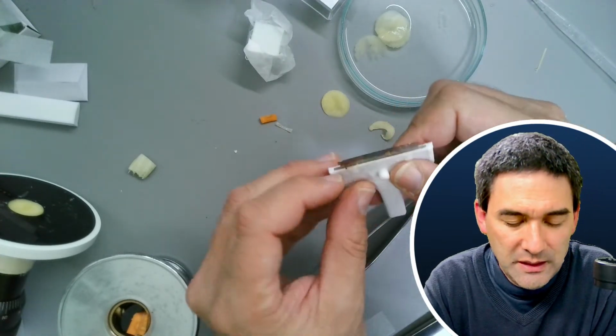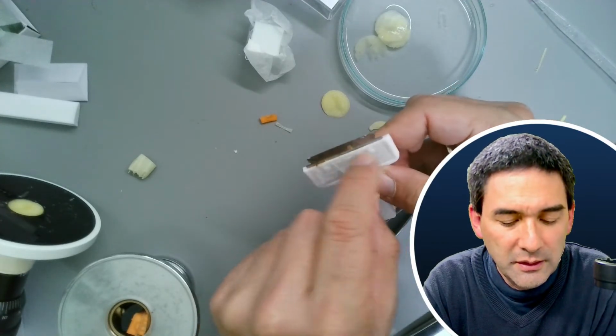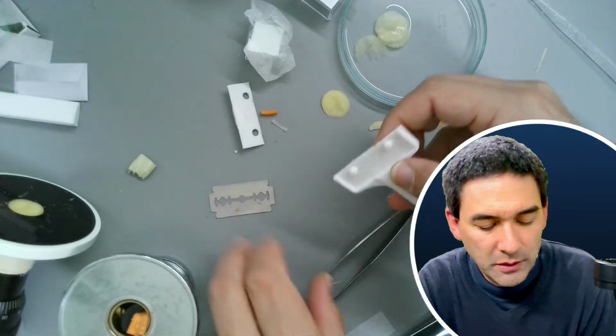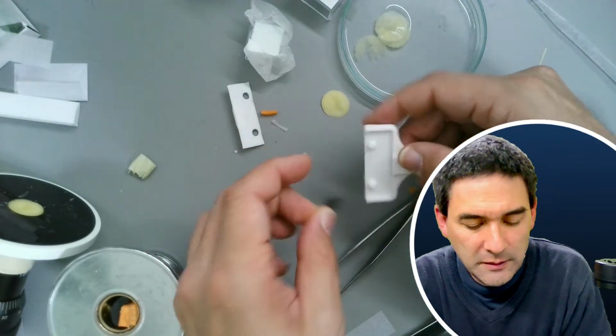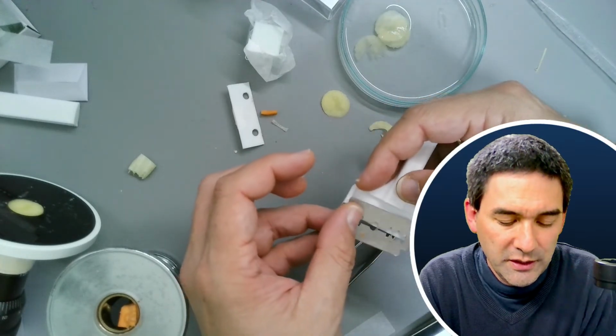Because essentially the center of the blade is held by those two little things here. Up, so here we go, almost cut myself. But that's basically how it looks like here. Those little holders here, and they go in here.